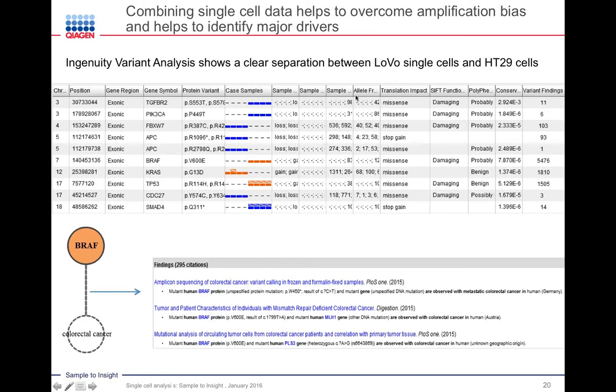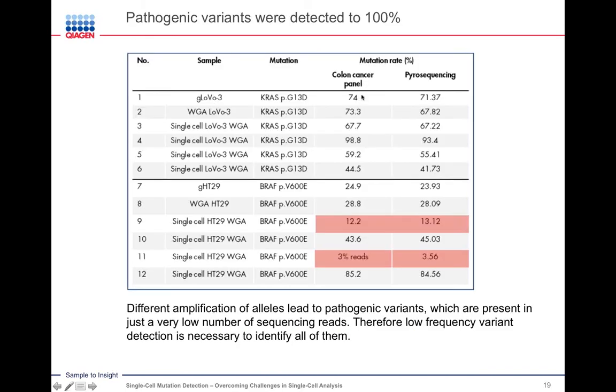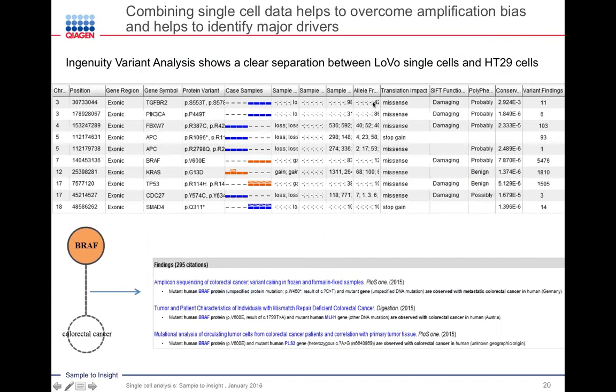And here you can also see the allelic fractions that were identified. This region is also uploaded as part of your data into the variant analysis, so you can capture all of that as well. Furthermore, anything that you see that is describing the impact, if it's associated with a given publication, you can also drill down to that publication. So you'll have links here from PLOS ONE, from Digestion, and you can click on these links and see the abstract for these findings.